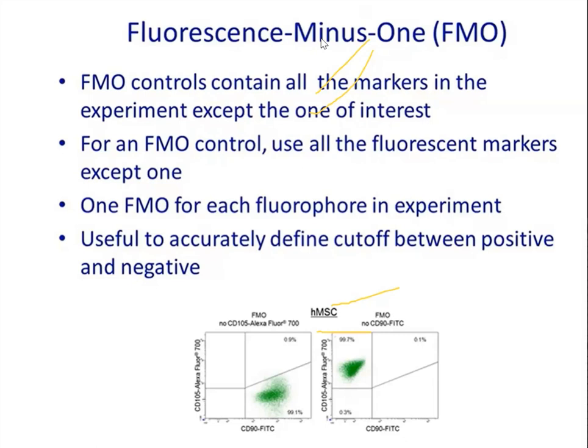How to adjust voltage? See, when you are acquiring in the machine, there is a small outlet, something called detector channels. When you click it, I'll be showing this during our processing class and acquisition class. A detector tab will be there. If you open it, there will be voltage nearby, and a small cursor nearby to increase and decrease it. In that way, you can increase or decrease the voltage.